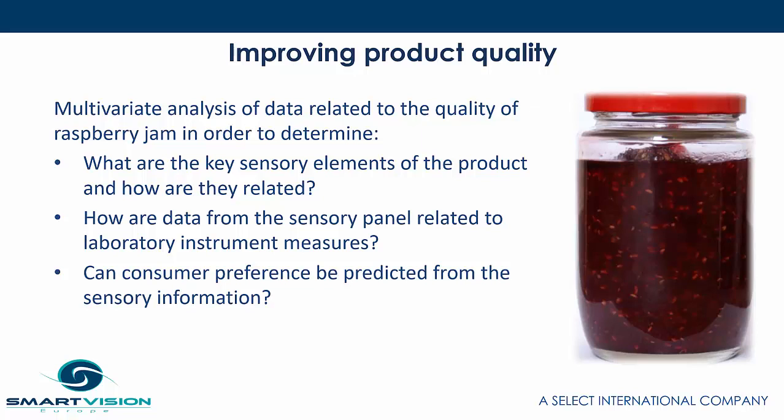The example I'm using here is based on the tutorial data that comes with Unscrambler. Unscrambler has actually got some very good tutorials, so it makes it a lot easier to get to grips with and understand how to interpret the charts. That also makes sense if you want to download a copy and have a go at doing this analysis yourself.